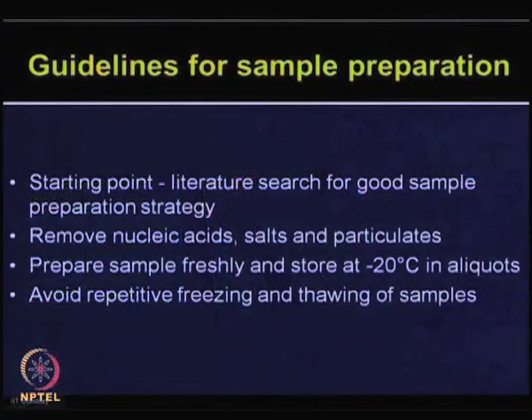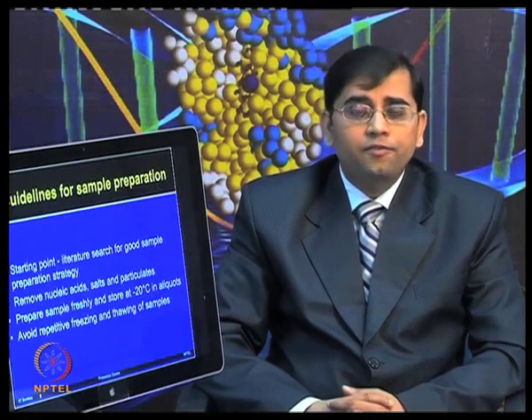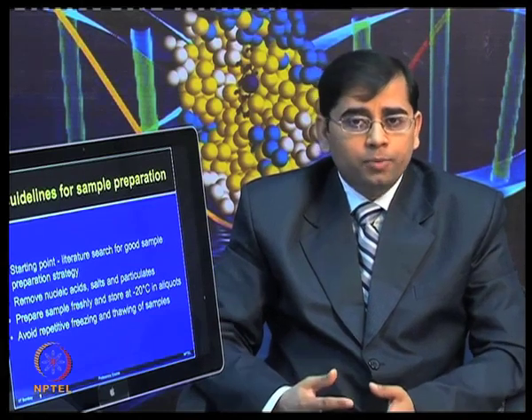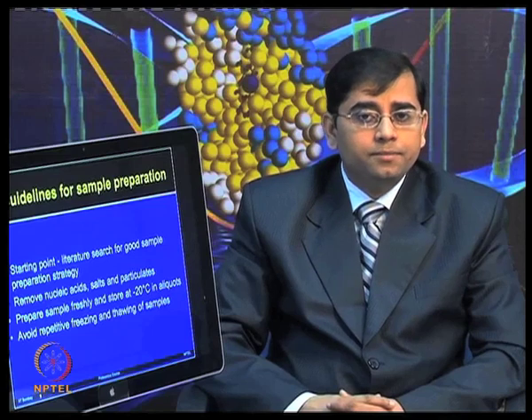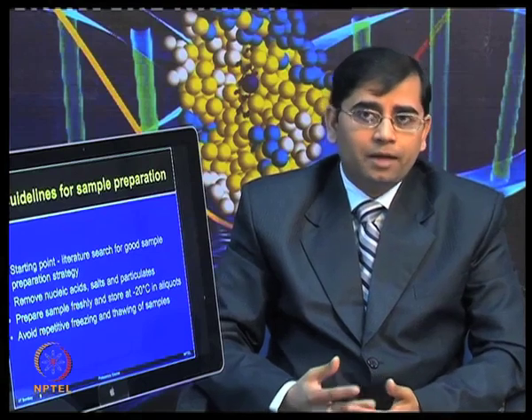So, I am giving you the guidelines for sample preparation. As a starting point, one should start with finding a good reference from the literature, and then try to modify the protocol depending upon the objective of that experiment. You need to ensure that you remove nucleic acids, salts and different particulates. Prepare the samples as freshly as possible and store them at -20° in small aliquots. You should avoid repetitive freezing and thawing of samples.